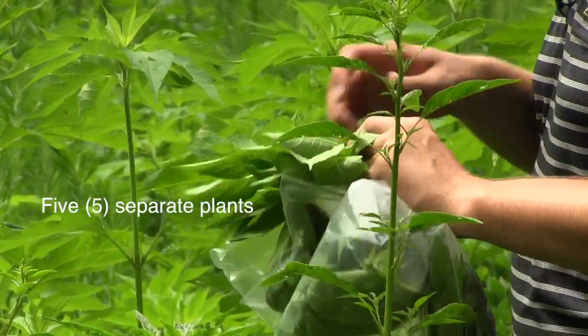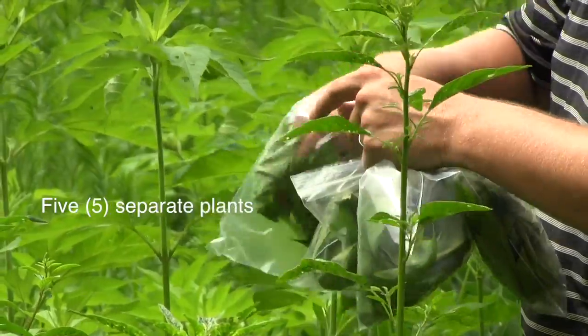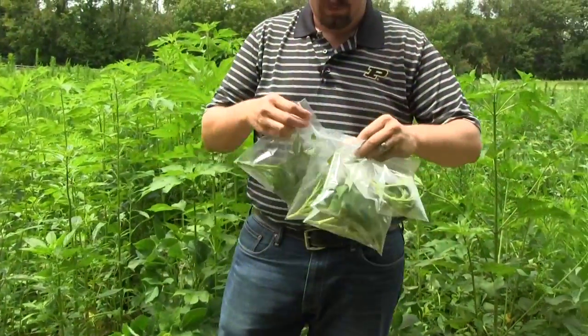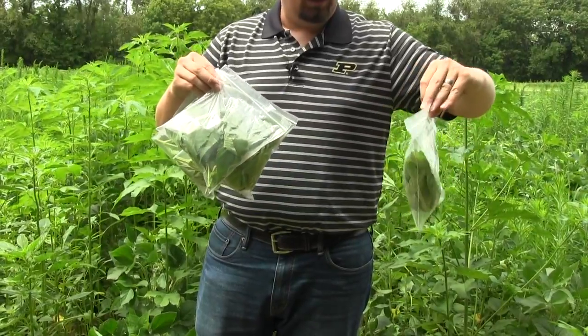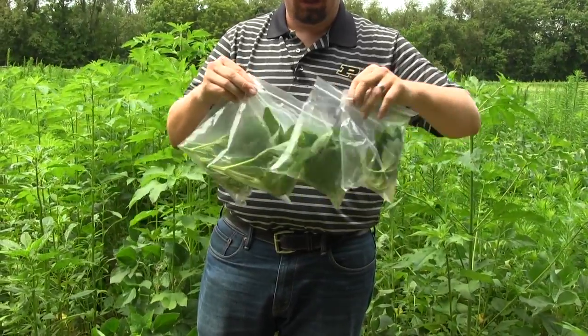We also want samples from five separate plants. Within the field where you suspect resistance, sample five different plants — six inches from the top of each — and put those into separate plastic baggies.